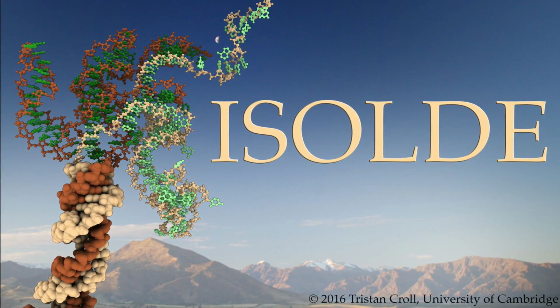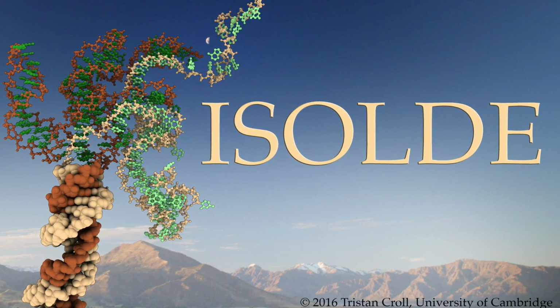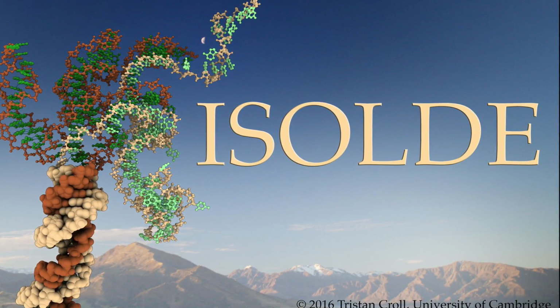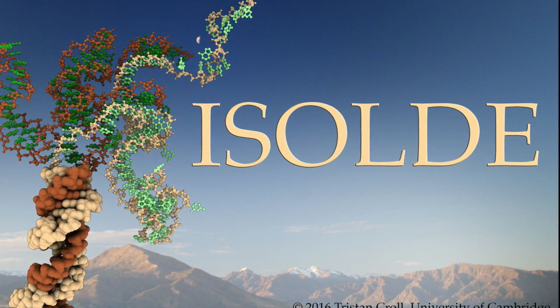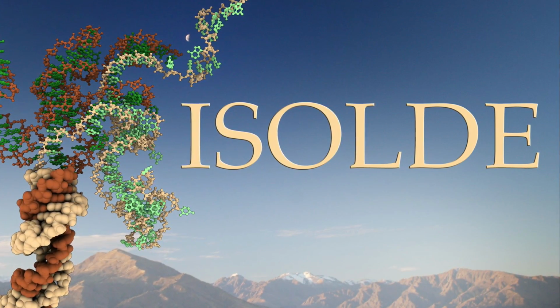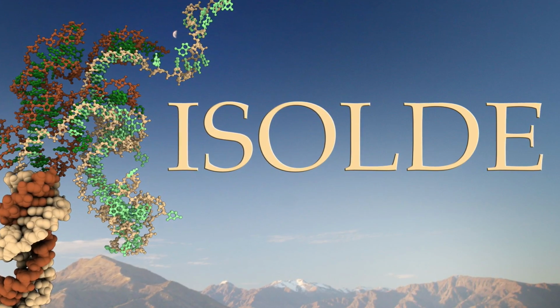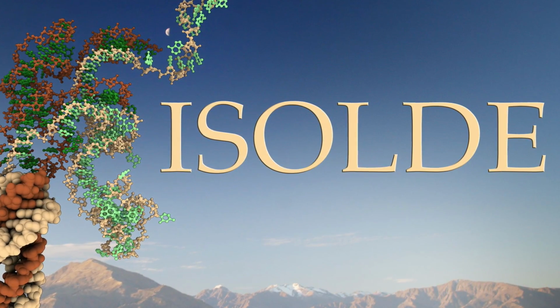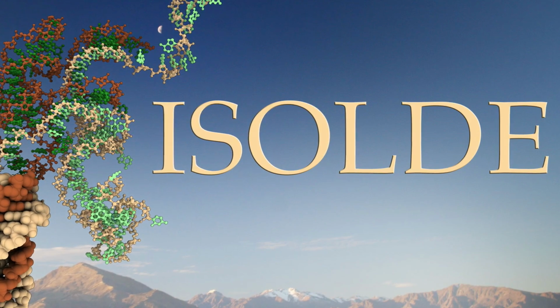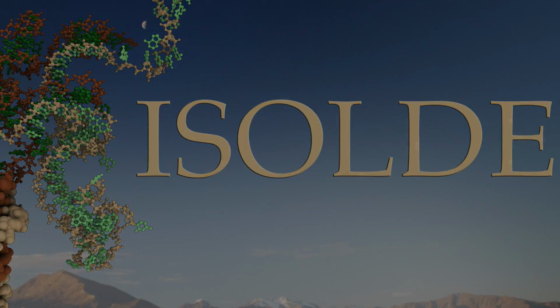Hi everyone, I'm Tristan, and I'm very proud to introduce my new baby ISOLDE. The name stands for Interactive Structure Optimization by Local Direct Exploration, but the simplest description is that it's a new interactive model building environment. In particular, it's designed to ease the often fraught task of building and refining models into low-resolution maps. So before we get properly started, I'd like to spend a minute or two discussing why that's important.